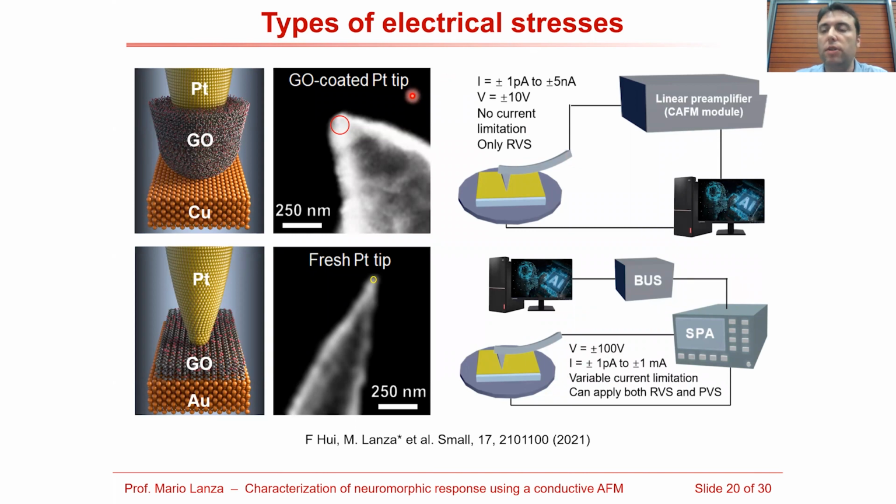Okay, so you can see we have used two setups. The first one is we use the tips that are coated with the graphene oxide, but we also use some as-received tips, and we put the graphene oxide on the surface of the sample. So using this setup, of course, the tip is sharper, so the radius of the tip at the apex is much smaller, and here it is a little bit higher.